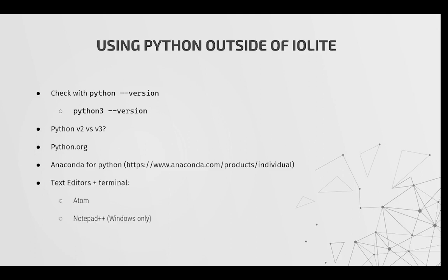You might also want to get yourself a good text editor. I recommend Atom because it is available for both Mac and Windows. Also on Windows, another solid package is Notepad++. Both of those are free.